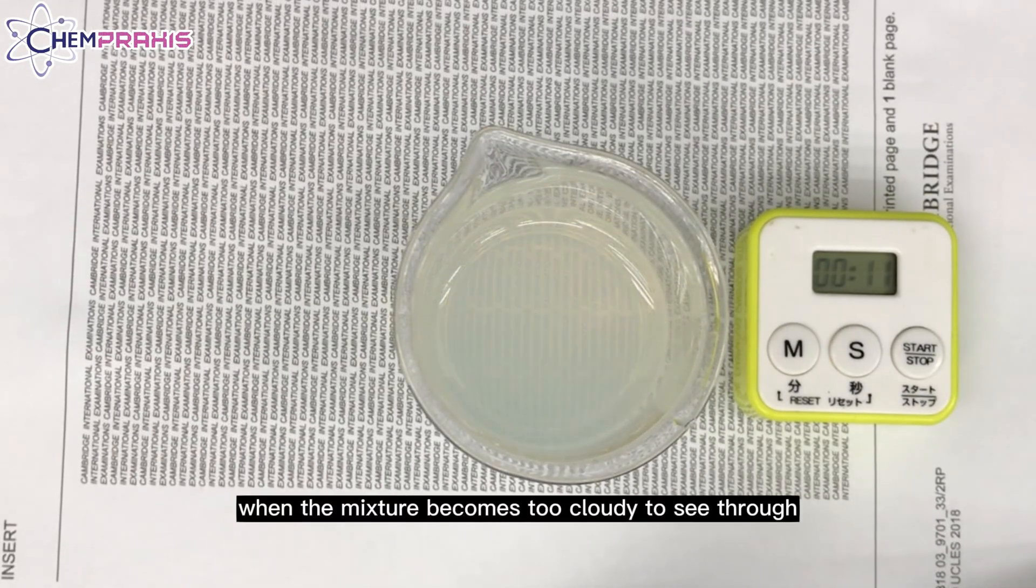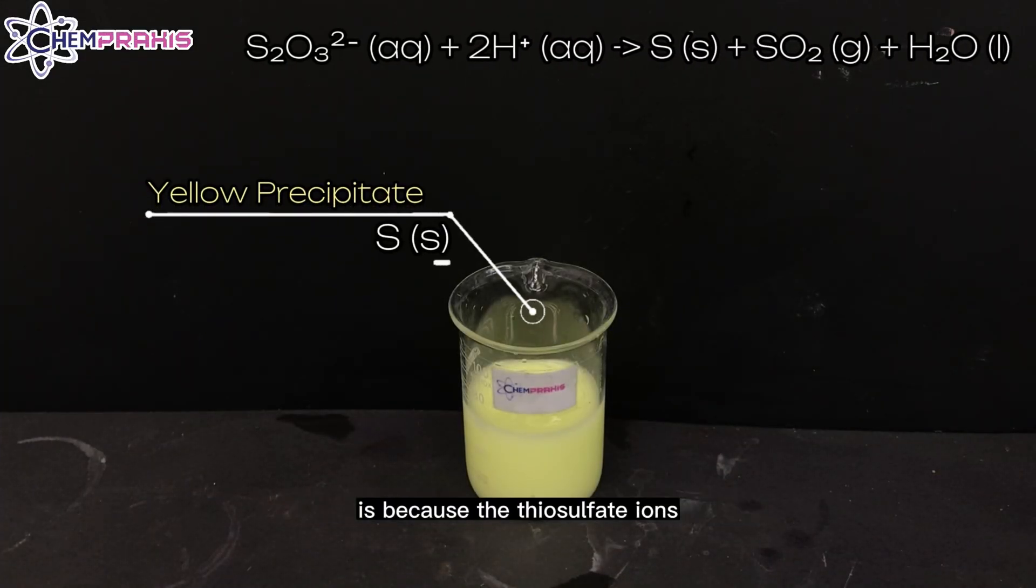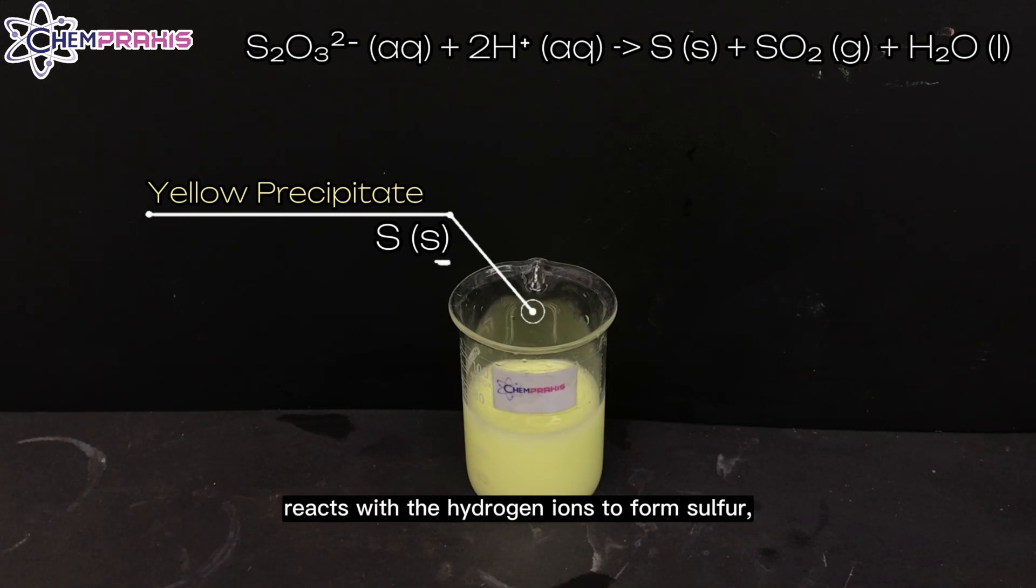Stop the timer when the mixture becomes too cloudy to see through. The reason why this yellow precipitate forms is because the thiosulfate ions react with the hydrogen ions to form sulfur, sulfur dioxide, and water.